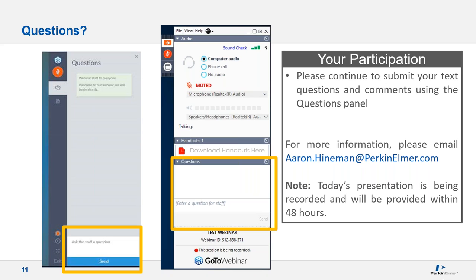One thing that's really helped me since I started doing ICP-OES is using single element standards. I use them a lot. If I think there's going to be an interference from a matrix, say a uranium matrix, I'll run 1,000 ppm uranium by itself and see where it's going to interfere. And if it interferes on cadmium, for example, then I'll run several single element cadmium standards and overlay the spectra of both. Single element standards are a great way to diagnose interferences and come up with solutions to them. Completely agree. Yeah, for sure. For ICP-OES, you definitely want single elements for all your interference work, especially.